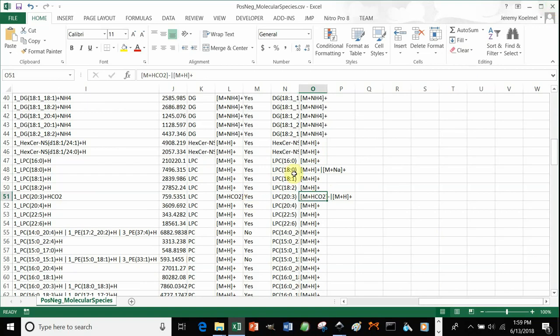So that will be your file. In the next tutorial, we can talk and walk you through how to do statistics using Metaboanalyst using this file.